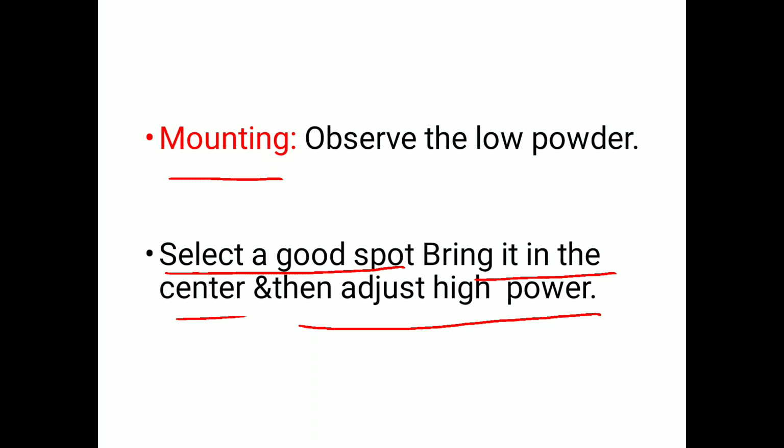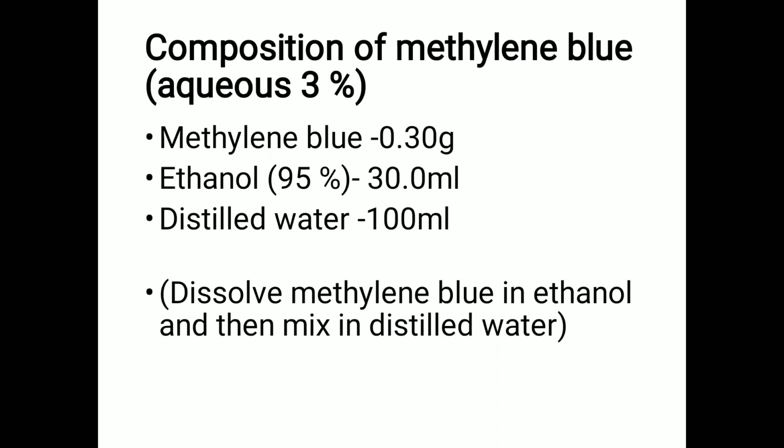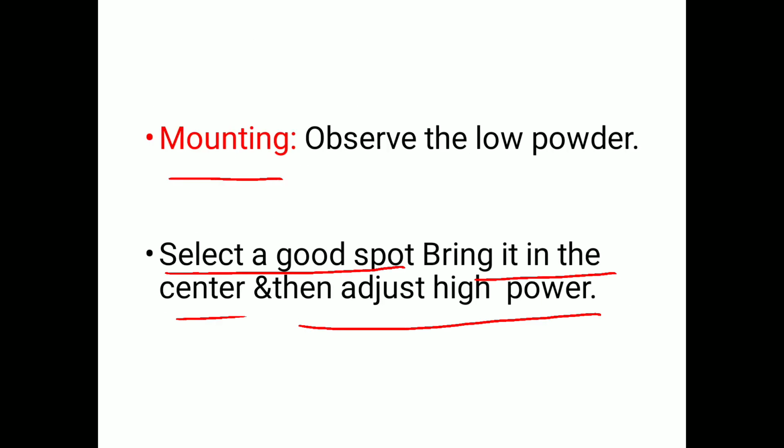When we observe under high magnification power, a clear image of the object is seen. So this is the procedure of simple staining of bacteria.